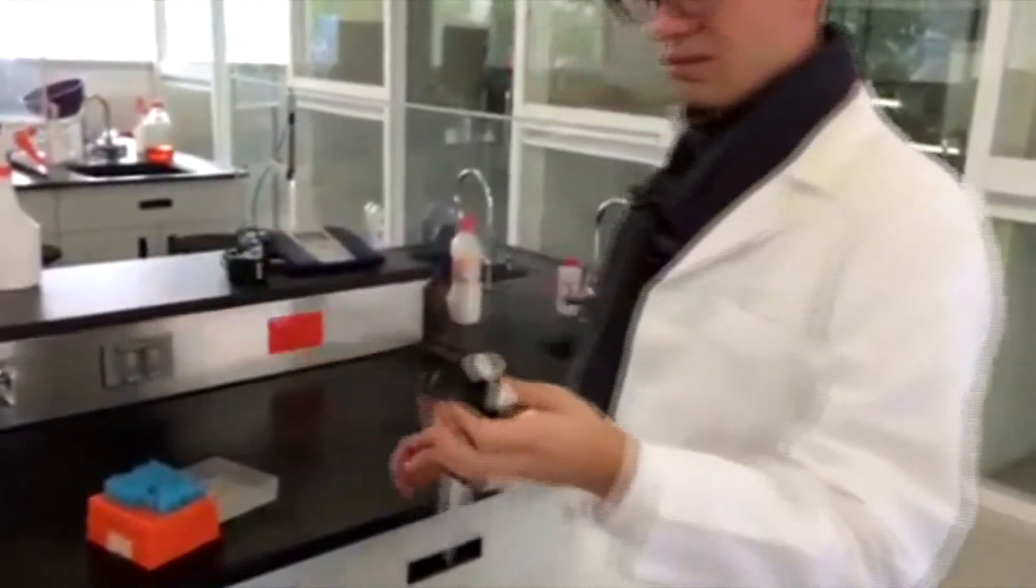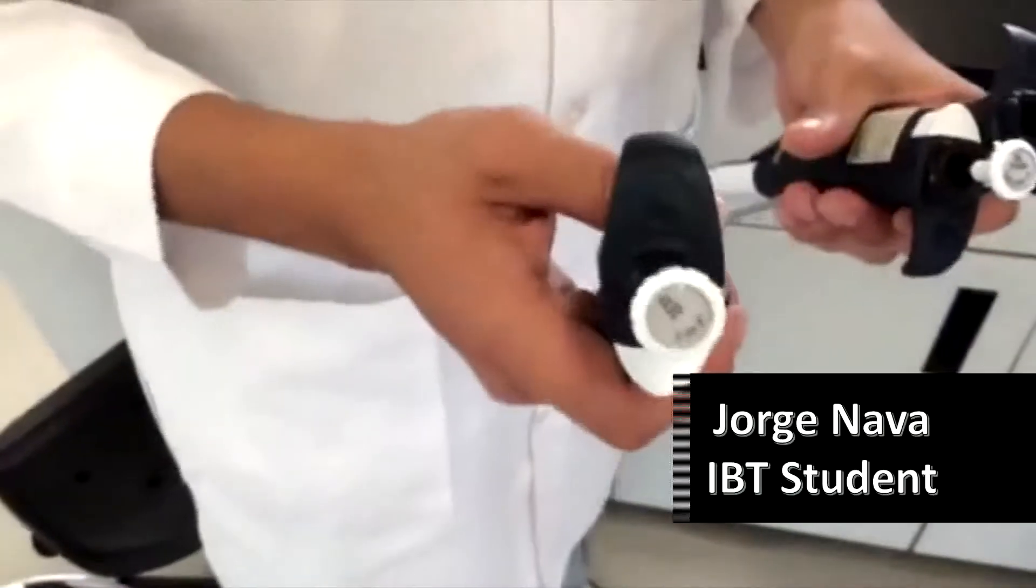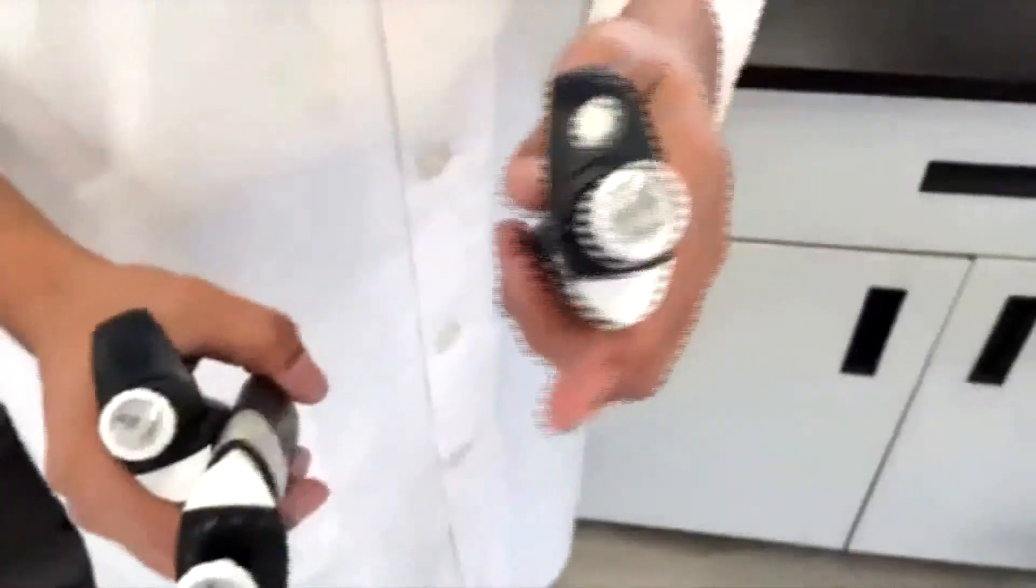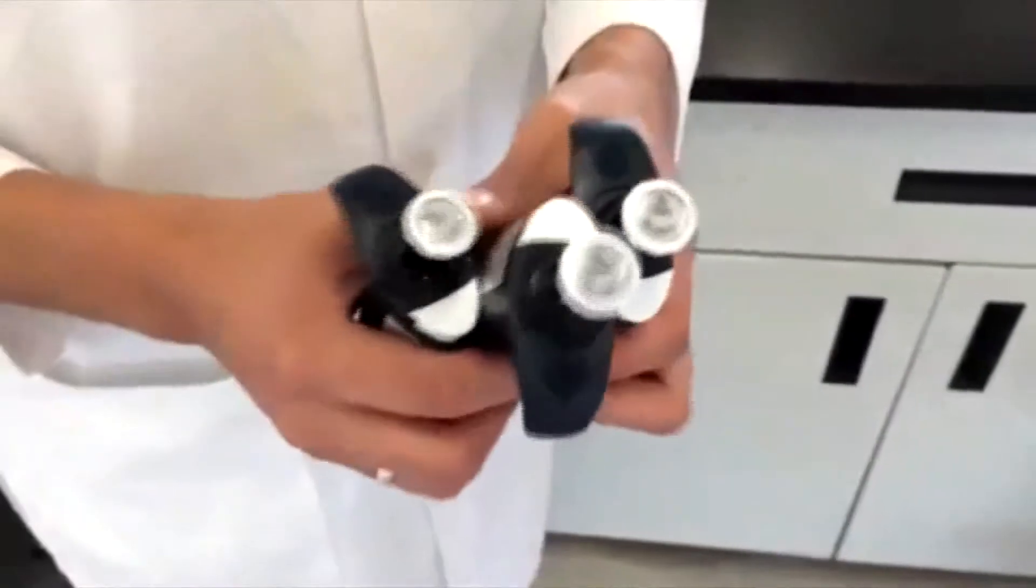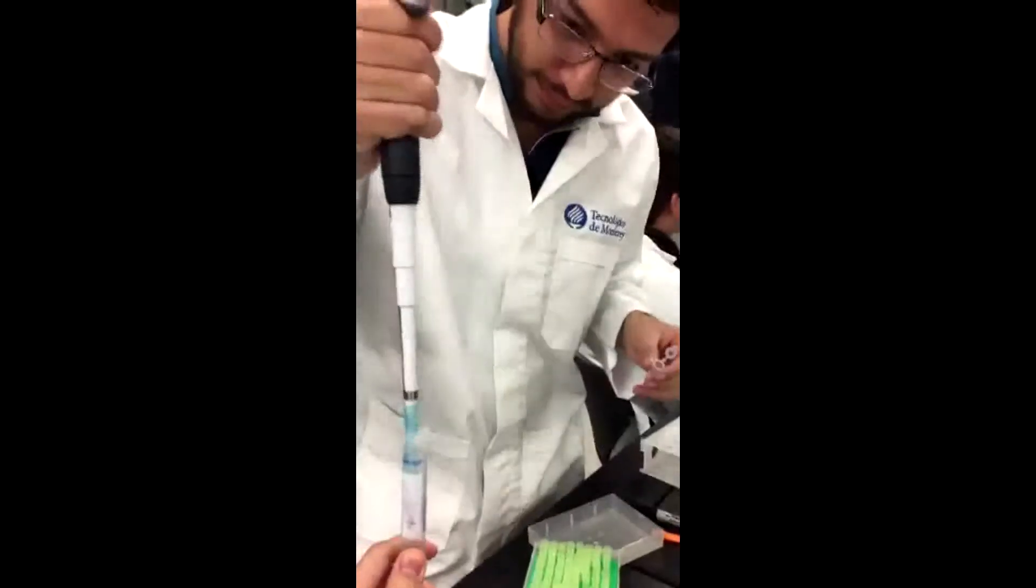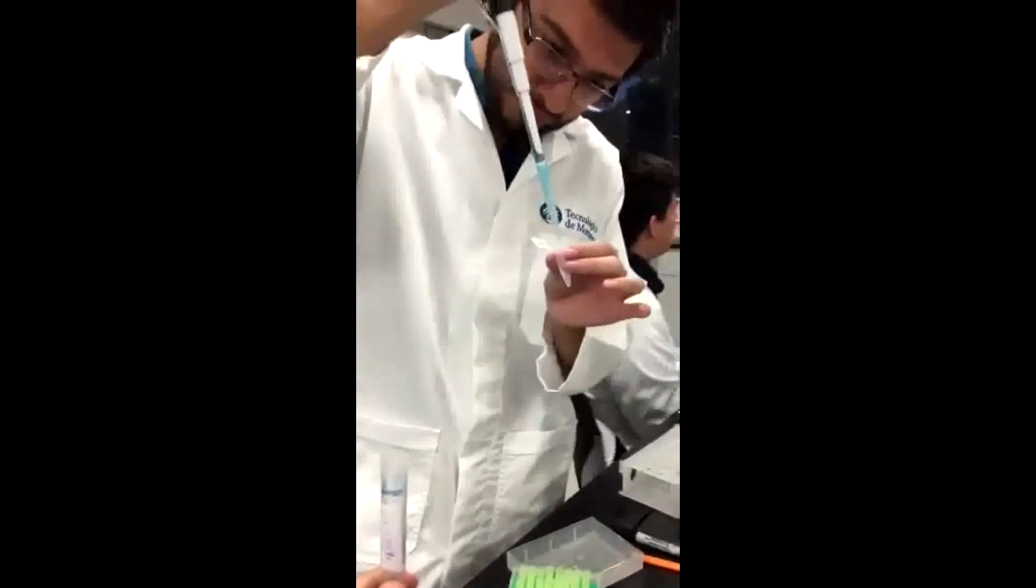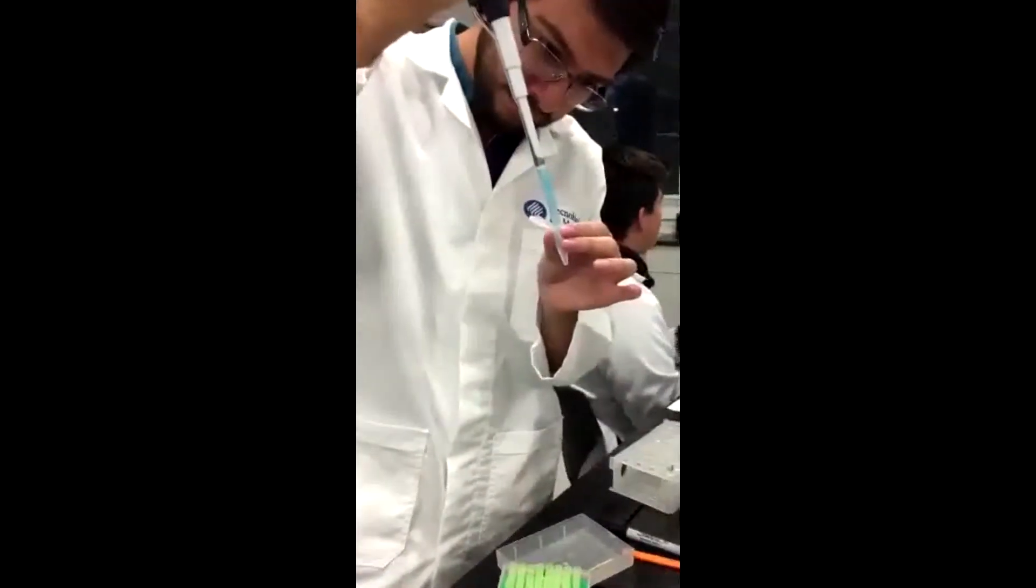In the third experiment, measurements were carried out to determine the reliability of the results of micropipets while working in different volumes, including the maximum and minimum range capacities. The three micropipets that were used were the ones of 20, 200, and 1000 microliters.